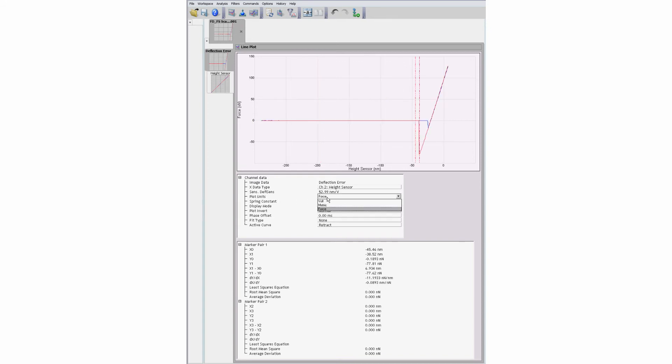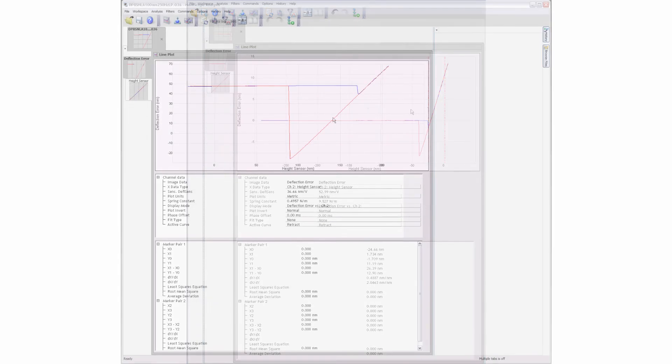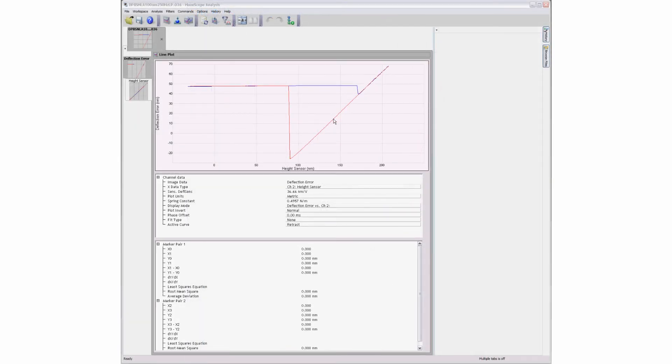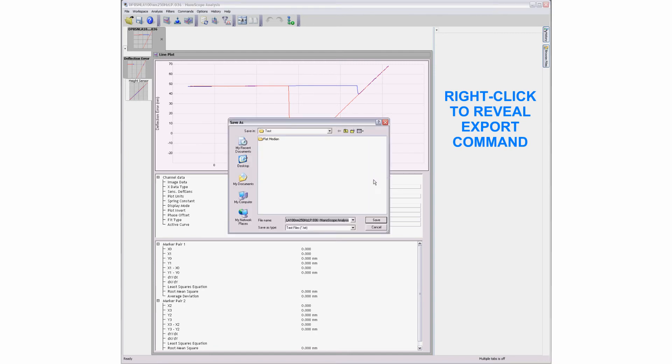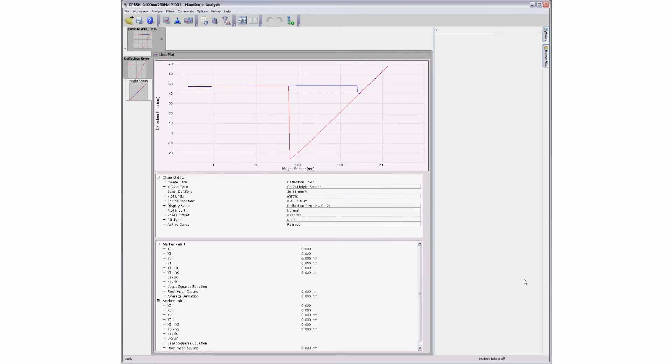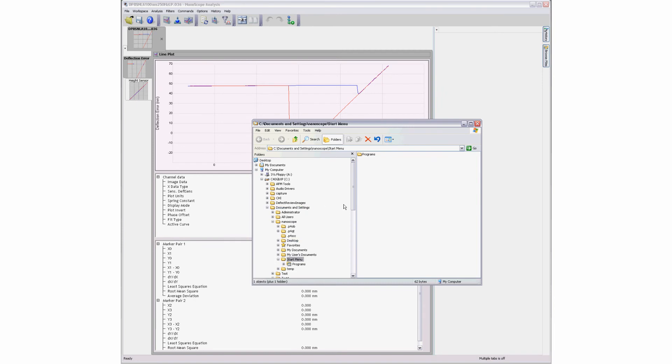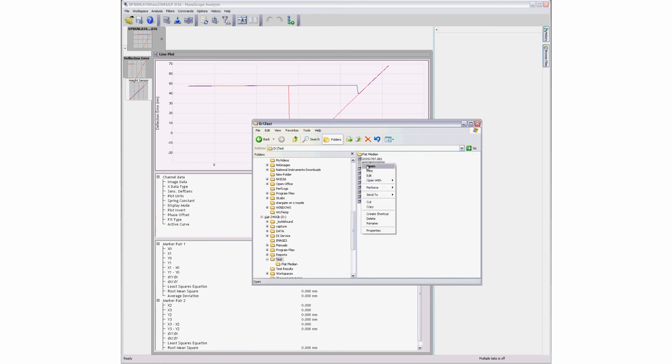The user has the option of changing the displayed plot units to reflect the force or deflection distance. Data points from a force curve can be saved to an ASCII text file via the export command, which is available from a pop-up menu when the user right-clicks on the curve display. Opening the file reveals the file header information along with the force and z-distance points separated into columns.